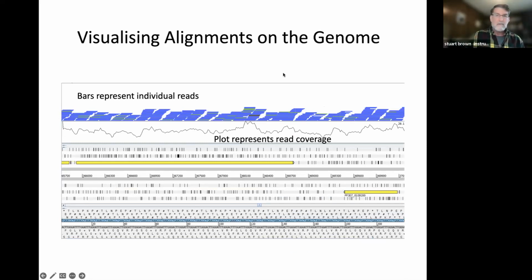You're going to want to skim along a lot of genes, and you don't necessarily need to have a little blue line for every single read. But it's good to know that data of this quality and this resolution is available.